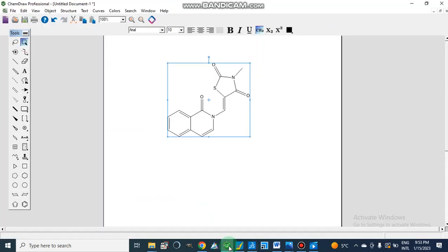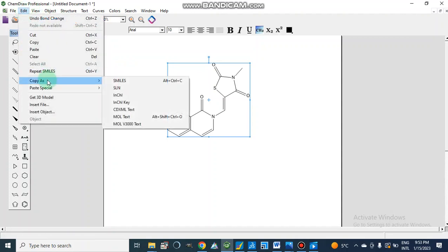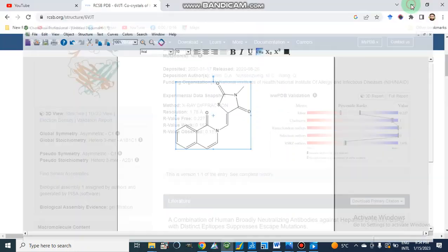Before this, I would like to mention that in our previous video we studied how we can synthesize small molecules with different scaffolds and pharmacophores. On the basis of pharmacophores or scaffold modeling through Swiss Similarity we can build analogues. In that video we told you that we can copy a small molecule, go to Discovery Studio Visualizer, and get the SMILES file. But my teacher corrected me — I am thankful to him and Dr. Umar Ashid — that we should select the small molecule, go to Edit, then Copy As, and then SMILES file. In this way we can copy the SMILES file and paste it in Swiss Similarity or wherever we need it.